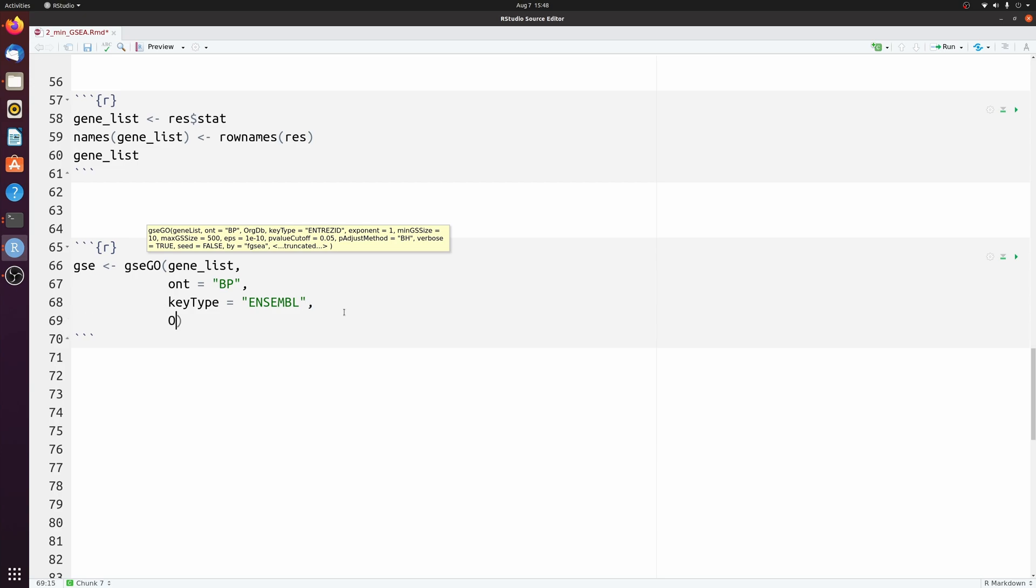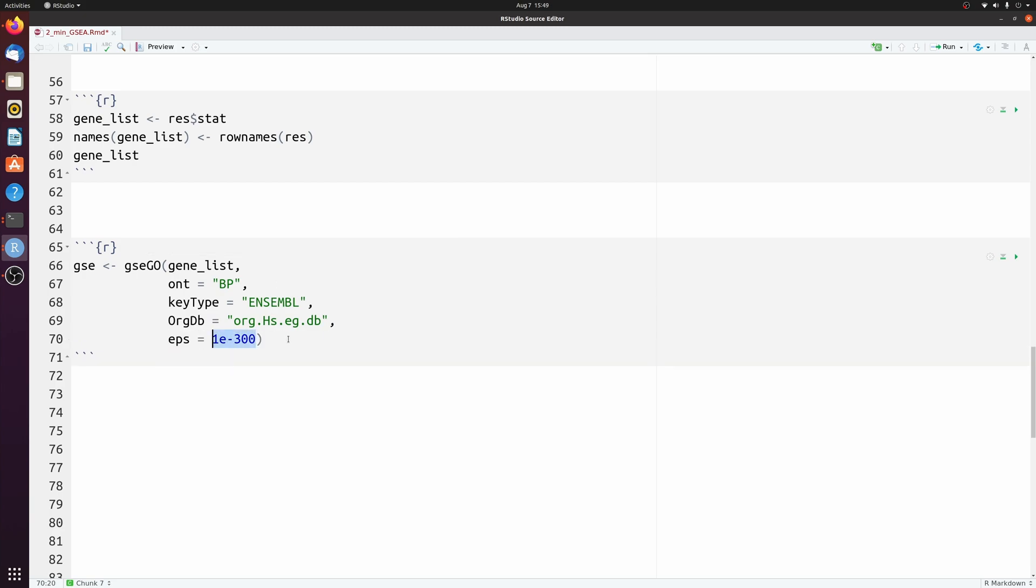And then our organism database. And then I'm going to max out the EPS variable. It'll make your p-values more precise.